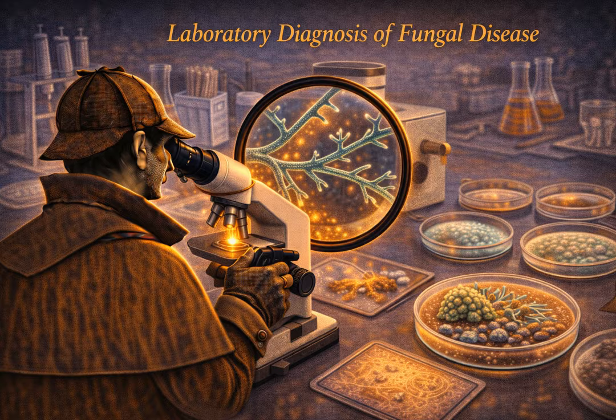Their cytoplasm stains pink, just like human cytoplasm. If there are only a few hyphae scattered in the tissue, they can be completely invisible on H&E. That's why, if you even suspect fungus, the pathologist needs to order special stains, specifically GMS and PAS. Let's break those down. GMS, Gomori methenamine silver.